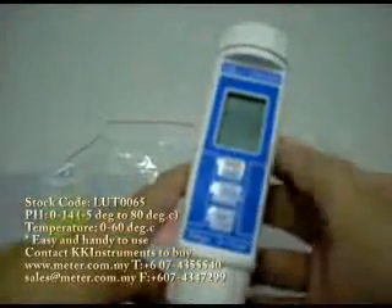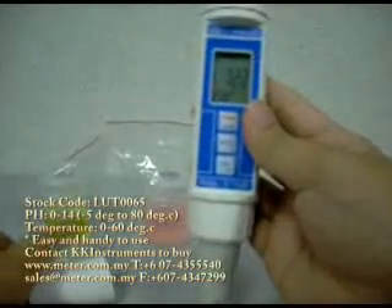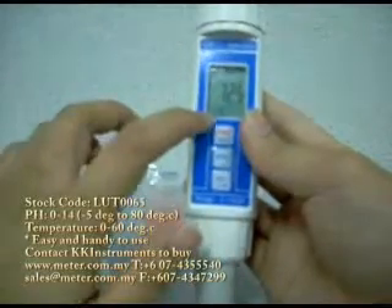First, we turn it on. This unit is very easy to use. You just have to turn it on, open the cap, and put in your solution. Then it will give you a reading of the pH, as well as the temperature of the solution.